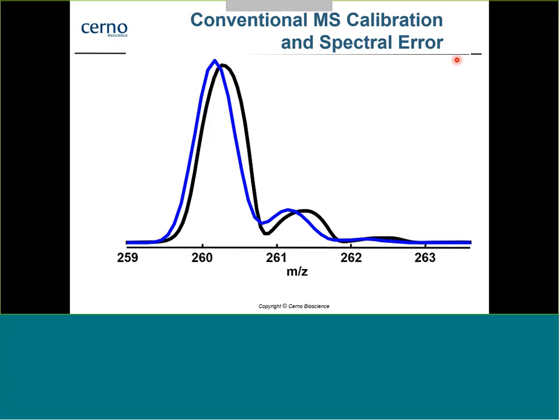And we can use this for identification of unknown formula as well as for deconvolution of mixture species, which is what we're going to talk about today.